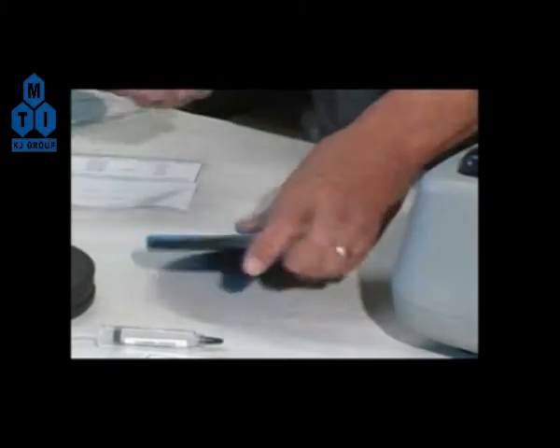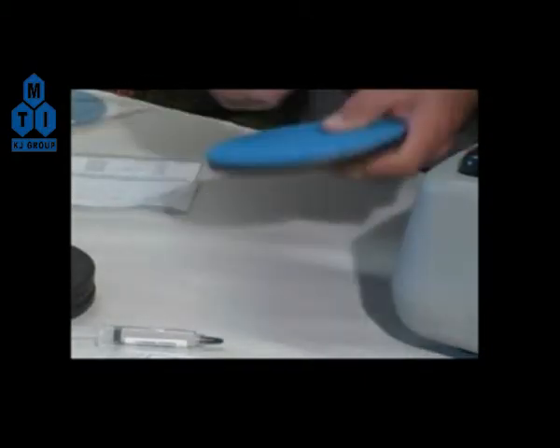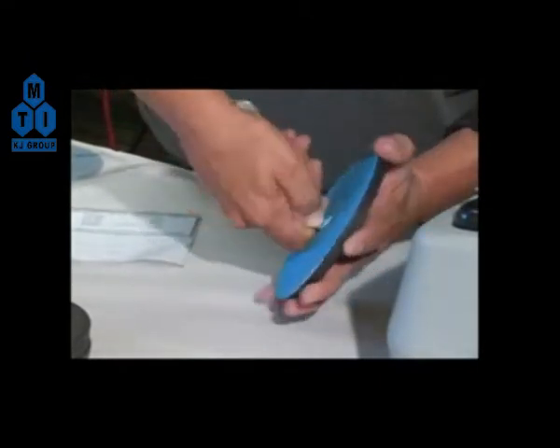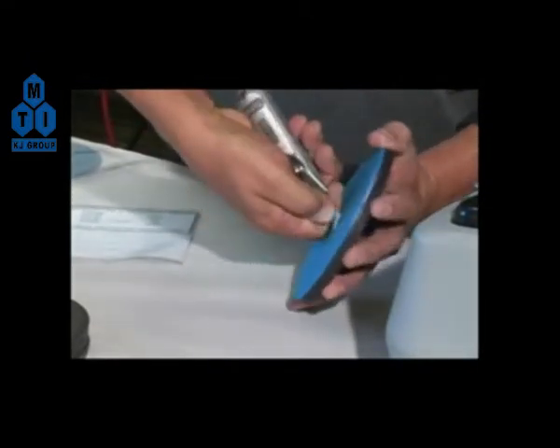Using a utility knife or X-Acto blade, carefully cut a hole in the center of the assembled disc that will remove all grinding surfaces from the center arbor hole in the plate.